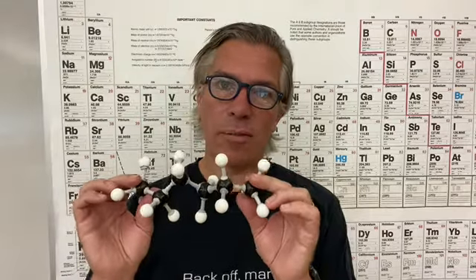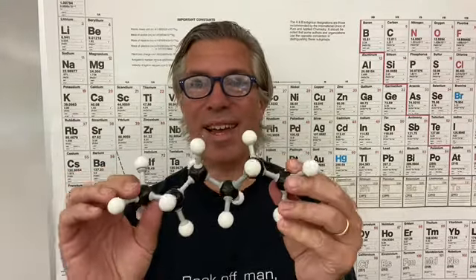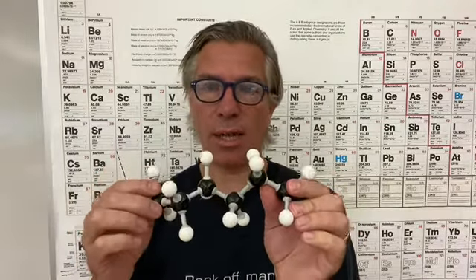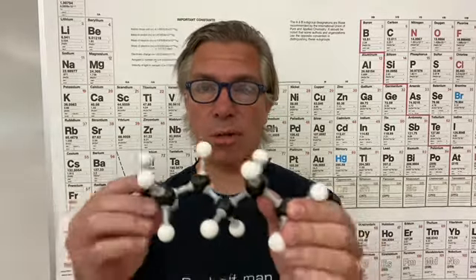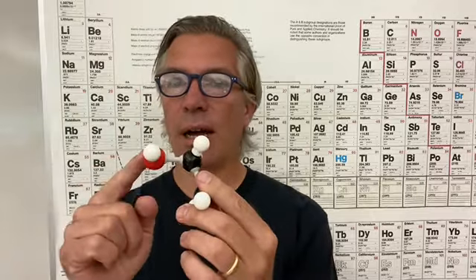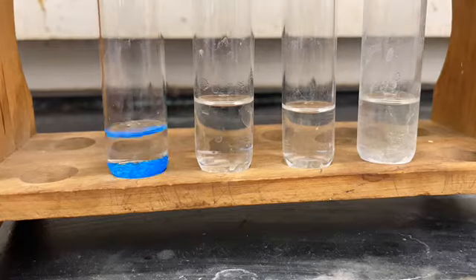Next, we'll try to dissolve them in two other substances, starting with hexane and ending with ethanol. Hexane is an organic solvent made out of 6 carbons and 14 hydrogens. I have a model here of regular hexane, or n-hexane, where all the 6 carbons are in a row, but there are several isomers of hexane that I could have built as well. Usually when you get hexane, you get a mixture of those, but they're all these non-polar organic molecules. Ethanol is another organic molecule, except it's a little shorter with only 2 carbons, and it's got an oxygen and an H on the end, so it's an alcohol. Since hexane is a volatile organic compound, we're going to do this one in the fume hood.